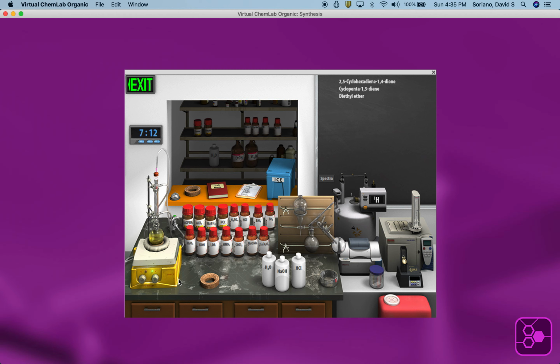And they use specific rate constants for these reactions, so it would dovetail with what you would normally expect. Some reactions have to be heated for an hour, some more than that. Some would be conducted at ambient temperature. Some would be carried out in an ice bath. I'm going to move this up an hour. See, right now we have those 3 components. I'll move up an hour, and you can see the product is forming. There's the monoadduct. They will only show you the monoadduct. They don't show you the diadduct. So you're reacting 1 mole of each of the starting materials.